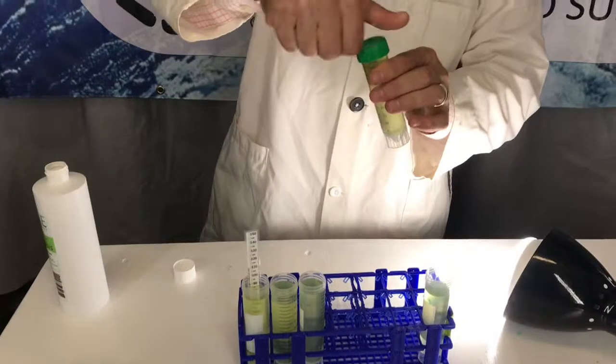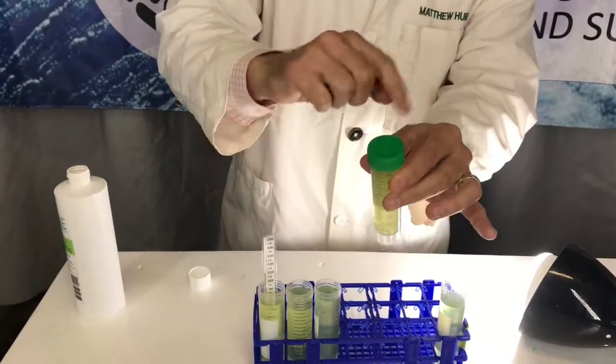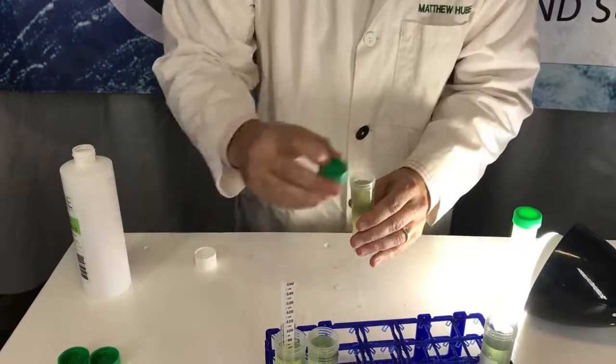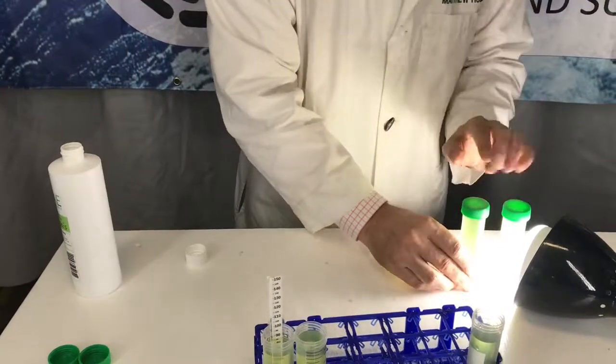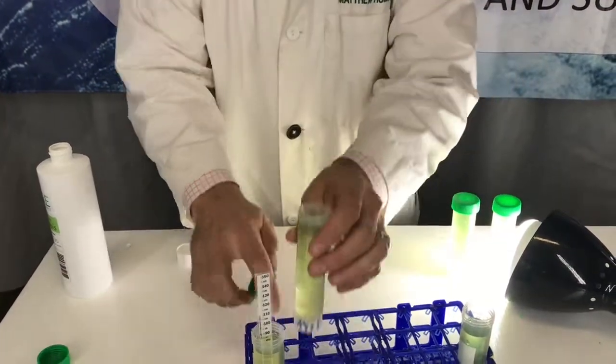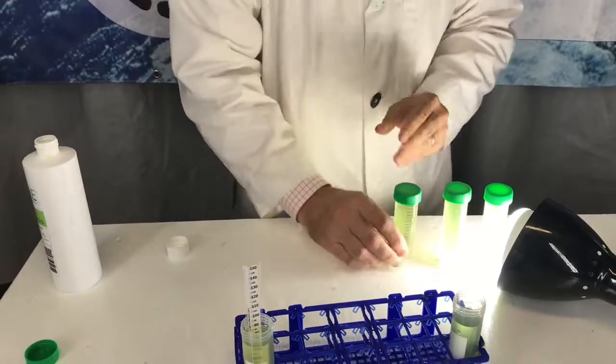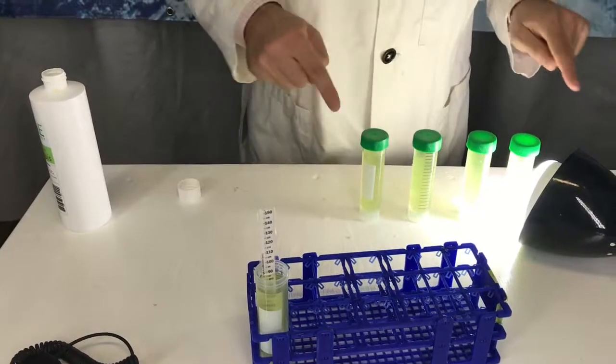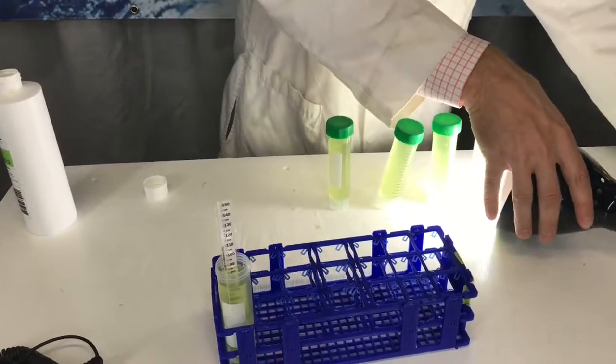Once you get to this point, have your students cap these back off just a tiny bit so there's some gas exchange. Then have your students decide where they want to put them in relation to a light source. We've got four different distances from a light source over here as an example.